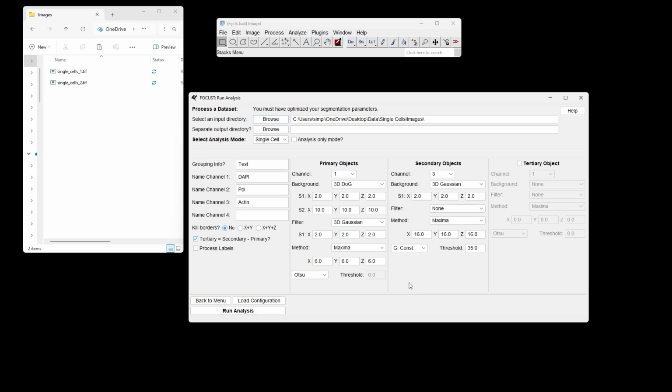What I'd like to show you now are some of the additional label processing options that we've included in FOCUST. It's very 3D focused, as the pun suggests. And so one of the things that I was interested in was the spatial distribution of stains within cells, within tumors or spheroids, and within nuclei in the case of speckle mode. I was also interested in the branching morphology of interesting shapes of cells and indeed nuclei. So we have this checkbox we said we'd talk about later. Well, it's later now, so let's see what happens when we open this menu up again.